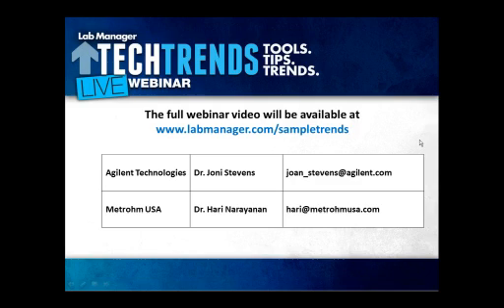And I agree with you, Tanuja and Hari. Yes, definitely. Everybody's looking for faster time with sample prep, less cost, and more accuracy. And that's one of the reasons why I mentioned and explained some of the just enough techniques, because they require minimal sample prep expertise. Everybody would love to avoid sample prep if they could. They'd rather give a kidney than do sample prep. And that's an issue, and everybody feels the same way. And the just enough techniques do give you a faster turnaround, less cost per analysis, and quite a lot of accuracy, especially with the sensitivity and selectivity that we have with our mass specs nowadays.